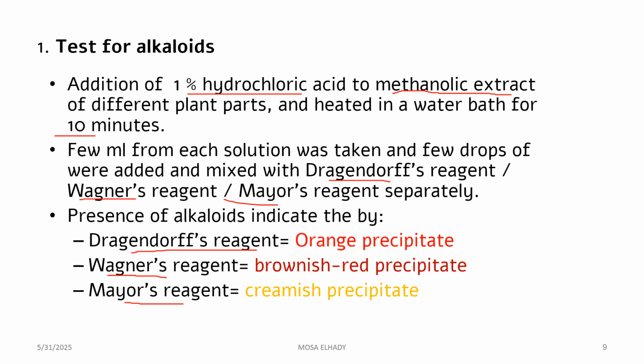So the first step is preparation by extraction with methanol and addition of HCl. And the second step is analysis. Analysis means the use of a suitable method. In this case, we use the reagents Dragendorff's, Mayer's, and Wagner's.